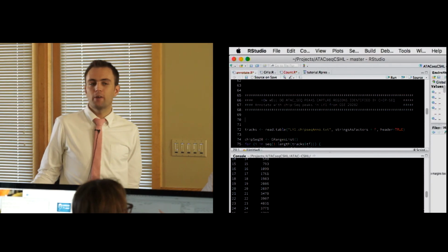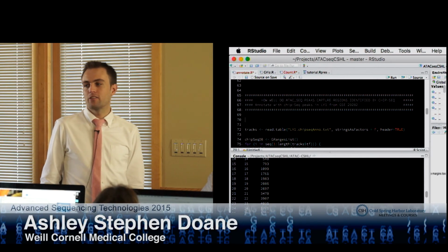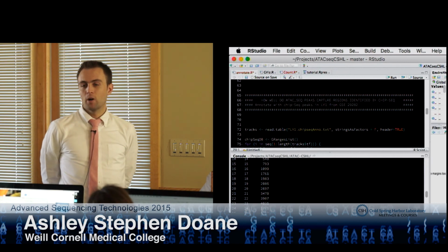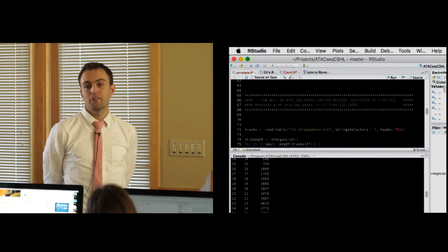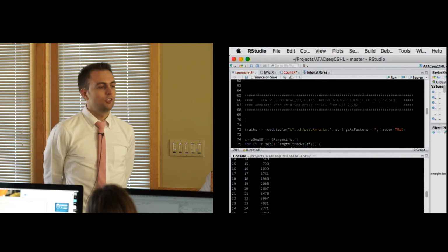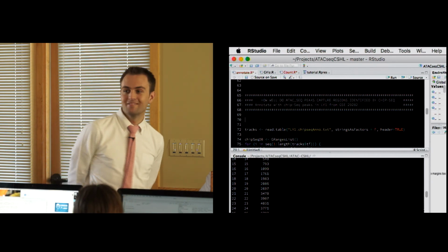So what other questions could we ask? With respect to available data sets, what could that tell us? Say you're interested in just characterizing this cell line, these LY1 cells. What kind of ChIP-seq experiments might we look for? Anyone? Antigen receptor?